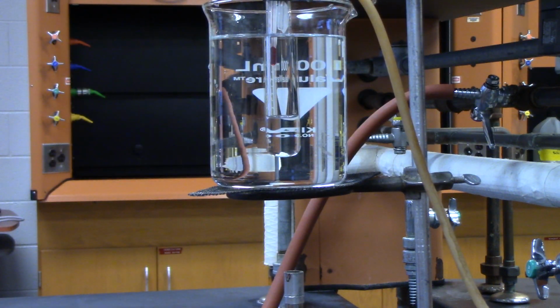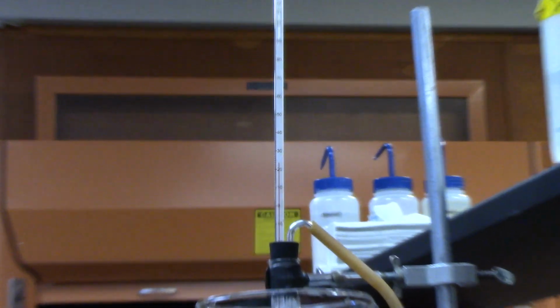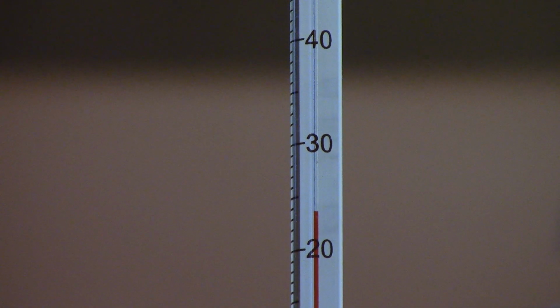Right now the temperature is at about 24, and it measures to the ones, so you're allowed to record one more digit than the measurement.